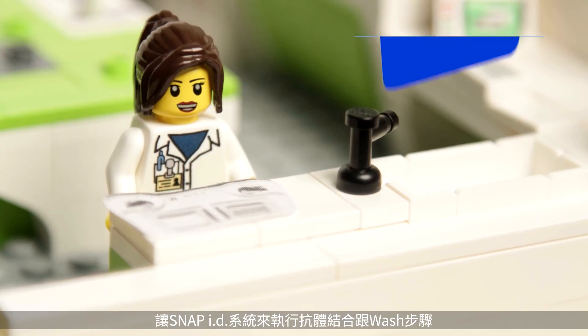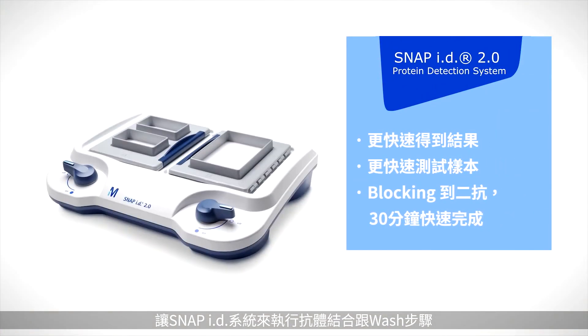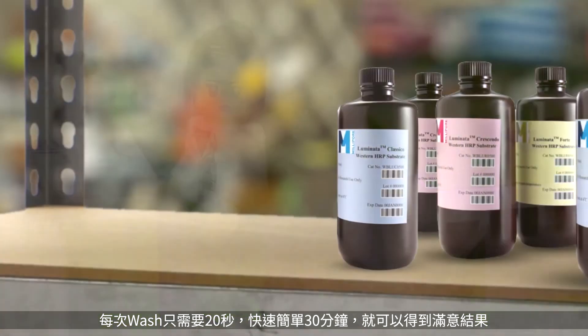Forget the rotary shaker — I'm going to do my incubations and washes in the vacuum-driven SNAP ID system. It'll just suck the reagents through the membrane. 20 seconds per wash? I'll be looking at data 30 minutes from now.